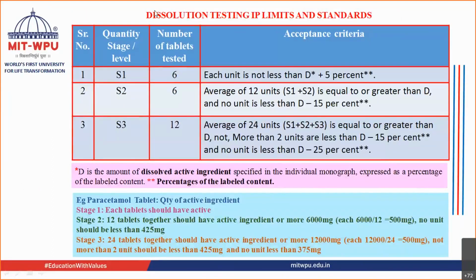Just a second, I'll explain. You have this vessel. Inside this vessel you have put the tablet and you have started the operation. After some time the drug is going to get released from the tablet.